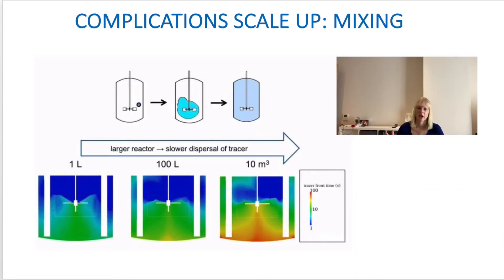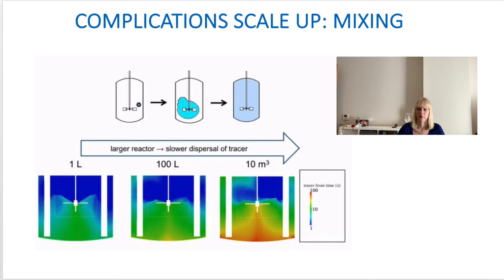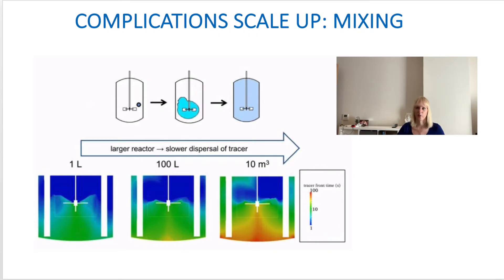Looking at this typical stirred tank reactor, the colors indicate where the tracer will go. You will see that the bigger it gets, the less homogeneous the spread throughout the reactor will be, and you will get issues with mixing. Most cells need oxygen to survive. In the smaller scenario, oxygen is evenly distributed throughout the vessel, but as you scale up, less and less oxygen gets through to all the cells. Even though oxygen is present, it's not able to reach everywhere in the reactor, so not all cells will be able to access oxygen and some will die off.